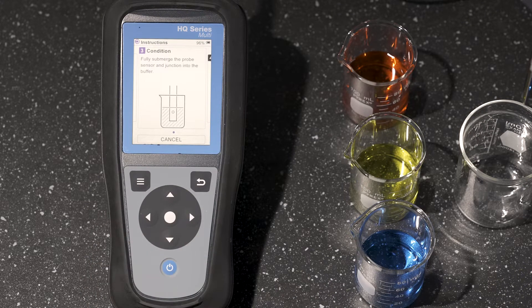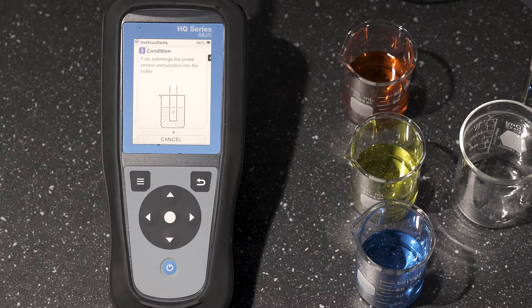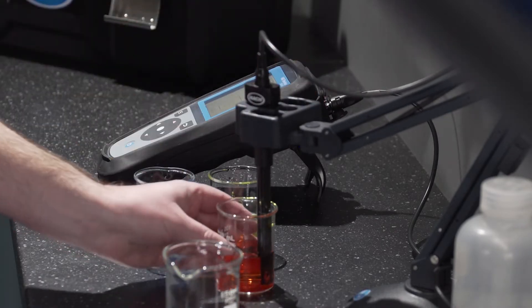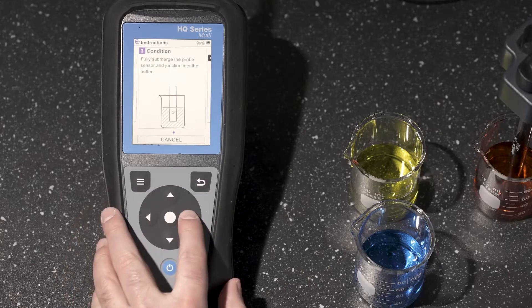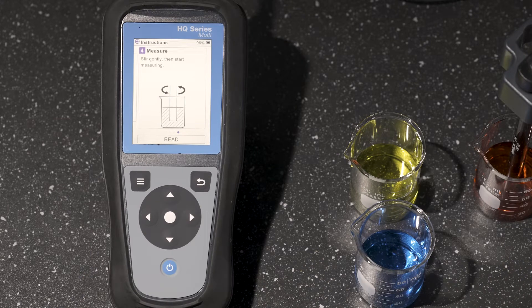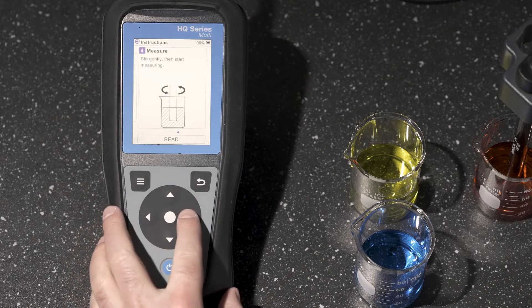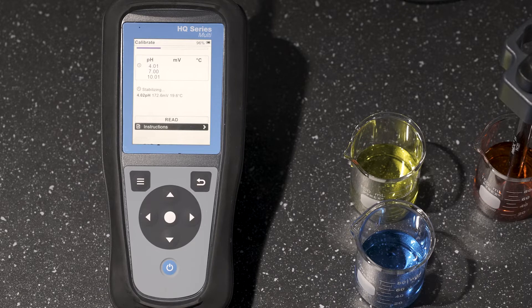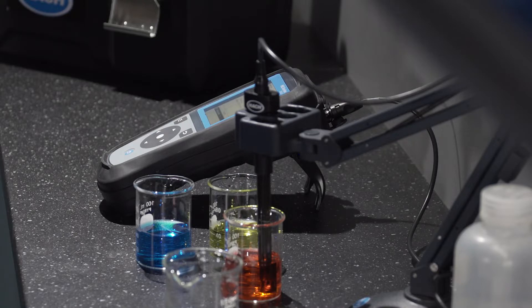Fully submerge the probe sensor and junction into the buffer. Gently stir and then start measuring. You can see the stabilization bar coming across the top and it is reading very close to that 4 buffer.